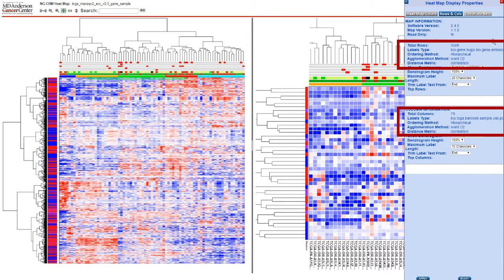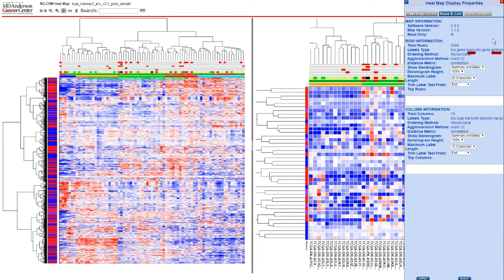If more than one label type is included for an axis, the additional types apply to hidden meta information associated with the labels. In this map, for instance, row labels are Hugo gene symbols and, in addition, each row contains a hidden Entrez ID. Link outs associated with Hugo gene symbols and link outs associated with Entrez identifiers will both be enabled.